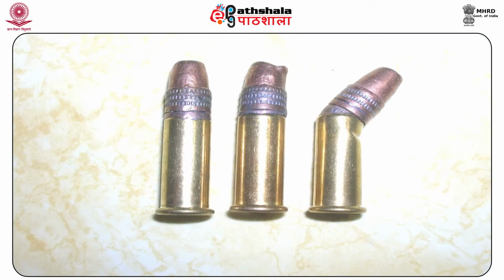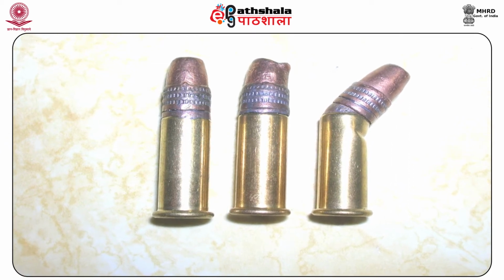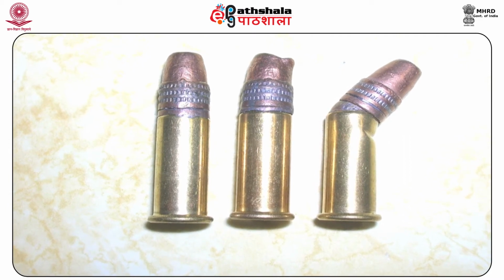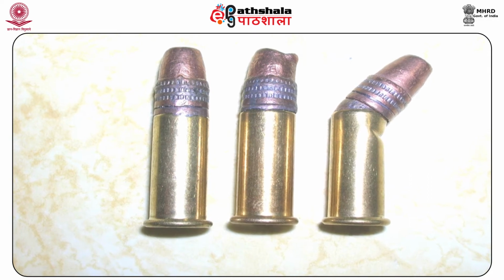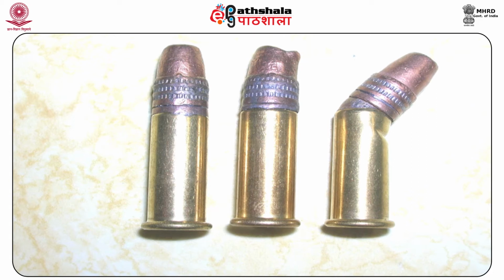In addition to the above elements produced from the primer, we may have contribution from other sources. Some particles of plain lead which has vaporized from the base of the bullet, copper and zinc particles from the inside surface of the cartridge case.